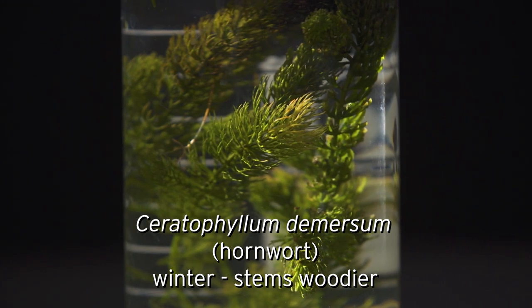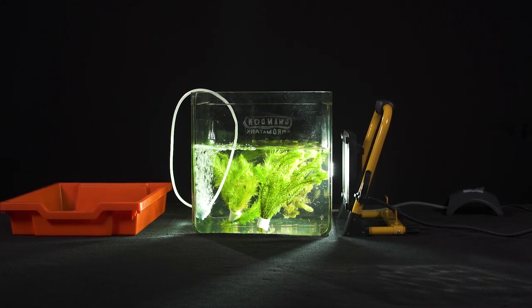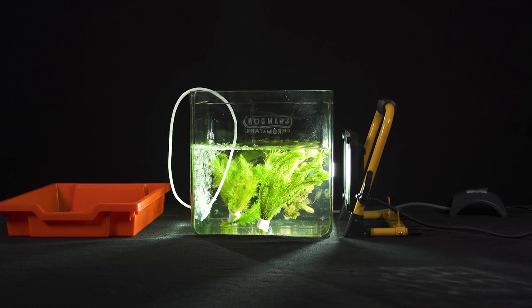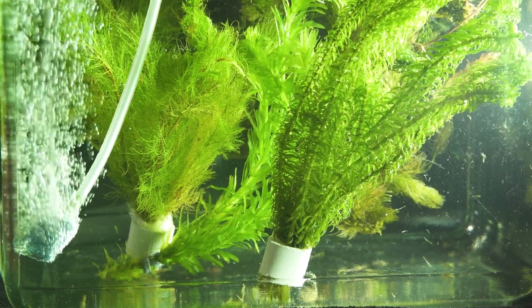If you're using pondweed collected from an outdoor pond, do consider that during the darker and colder months, it will not be photosynthesizing at a particularly fast rate. It's a good idea to get this weed out of the pond at least a couple of weeks before the practical is planned to take place, and illuminate it with a bright light in an aerated tank to allow the photosynthetic machinery to become active again.